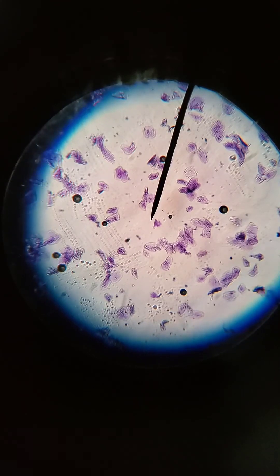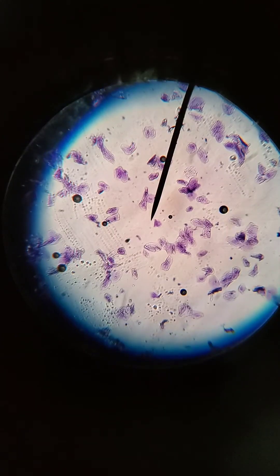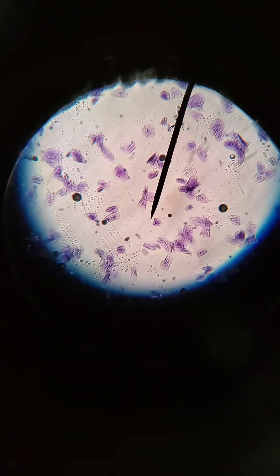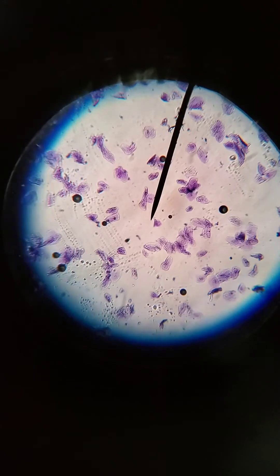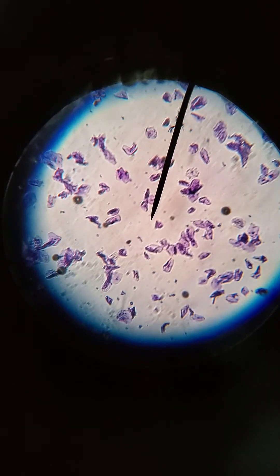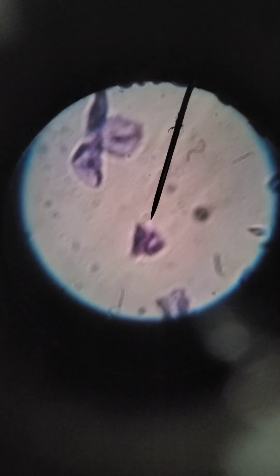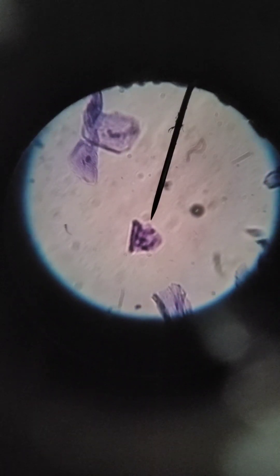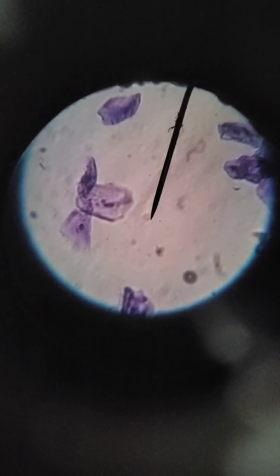Now we've taken cheek cells from the inside of my mouth. Let's focus this a little bit. Remember our trick about focusing the microscope? Once we get it focused, it should stay pretty close in focus. That's what the cheek cells look like on low power. Let's look at them on high power. Let's focus this just a little bit, then move around — there are a couple of cells right there. Let's see if we can find some prime examples of cheek cells.